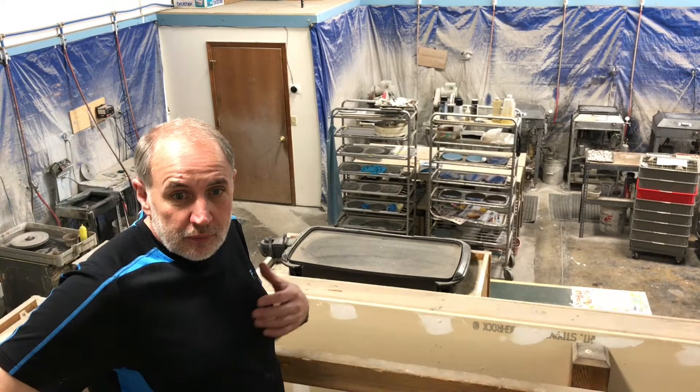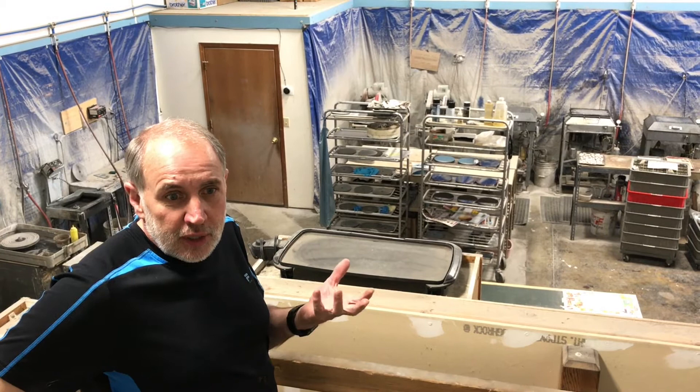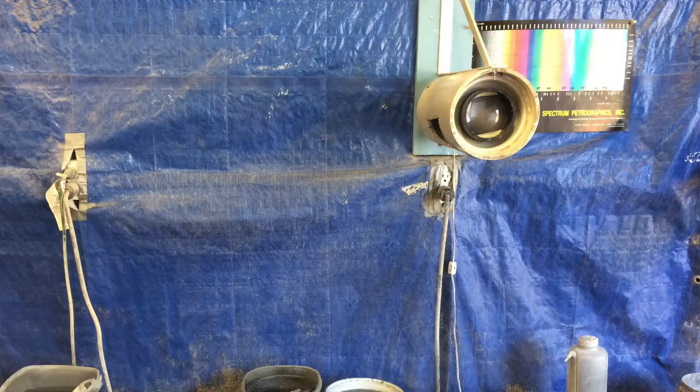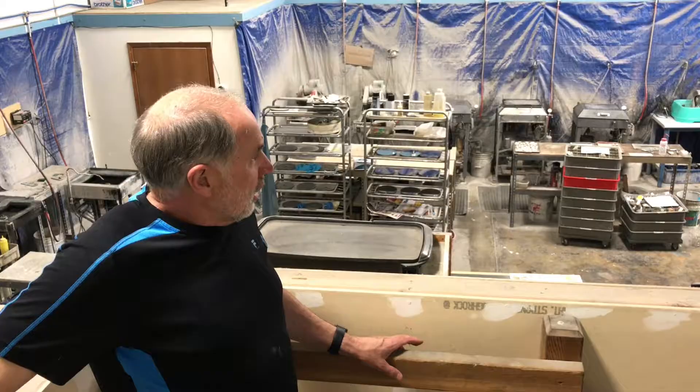Most of our equipment has been built by machinists and fabricators to our specifications, because very little machinery that's commercially available was suitable for what we really wanted. The machines have gone through a number of different versions as we've made improvements with research and development, finding better ways to improve the machines.